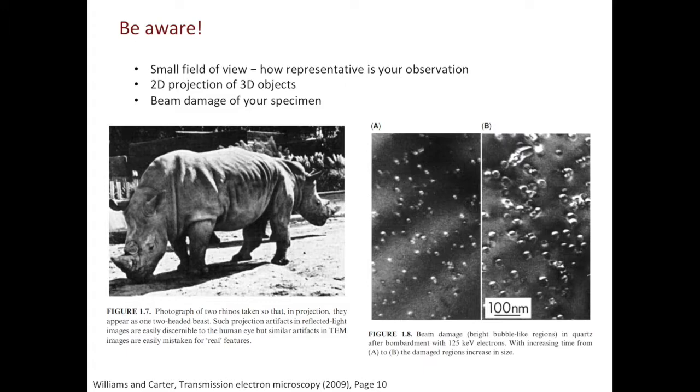The second thing to bear in mind is that in TEM, you are looking at the 2D projections of 3D objects. A classical example is the two-headed rhino you see in the figure on the left. The third thing to bear in mind is that you are dumping very high-energy electron beam into your material. Your material can get damaged. As shown in the figure on the right, the damage can accumulate as you increase the exposure time of your specimen under the electron beam.